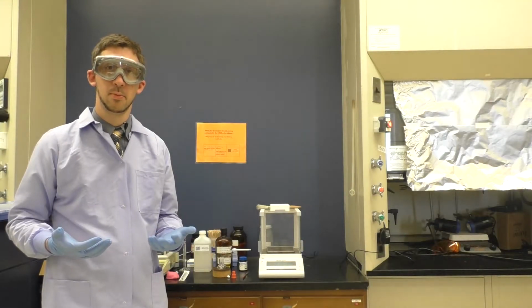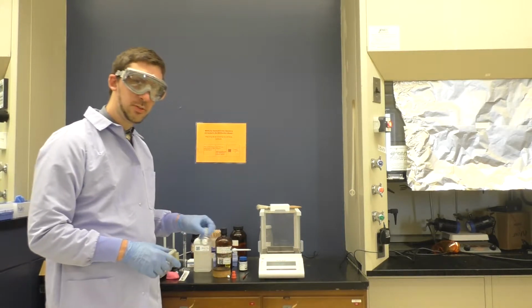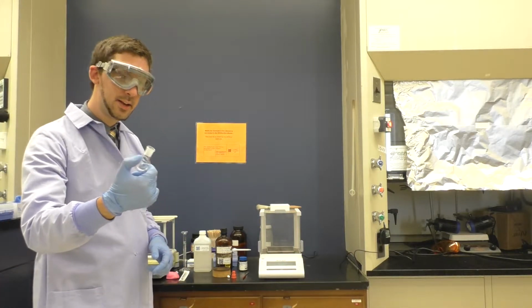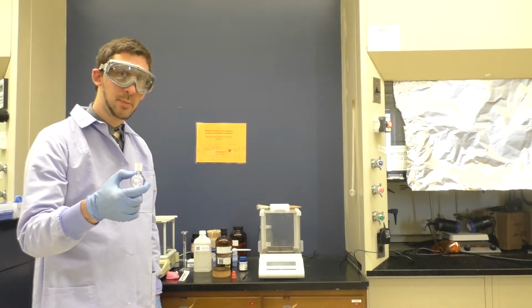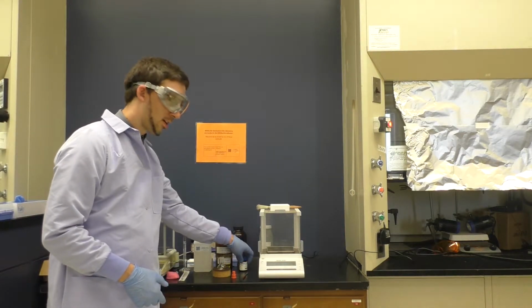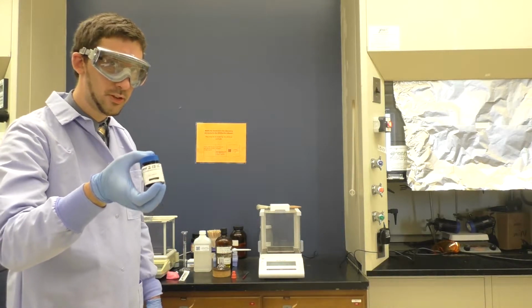So here we are in the lab, ready to set up the hydrogenation experiment. The experimental setup is actually very simple. I have a very small 25 milliliter round bottom here, where I will add a clean stir bar, and then I'll weigh out and measure out my reagents to add to this. Now, the reagents I've got are the palladium on carbon. I've got a 10% palladium on carbon material. This is solid.